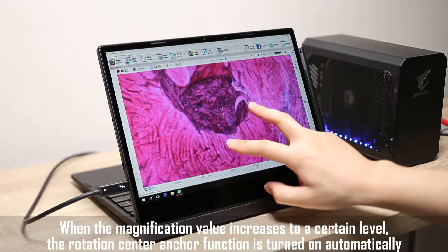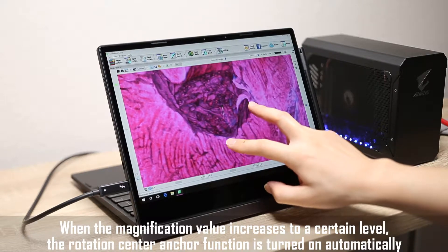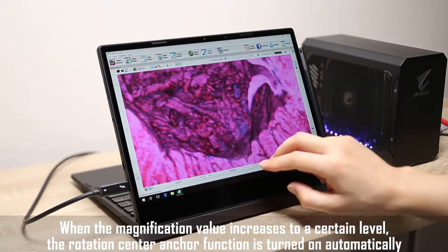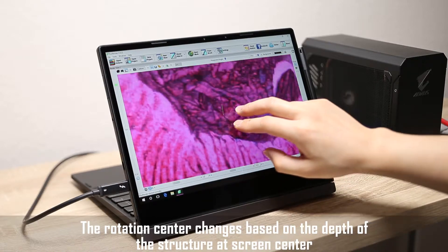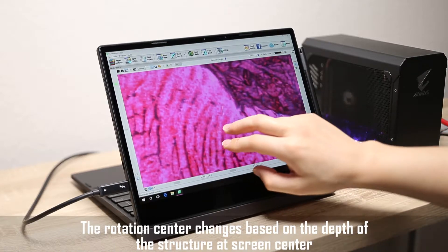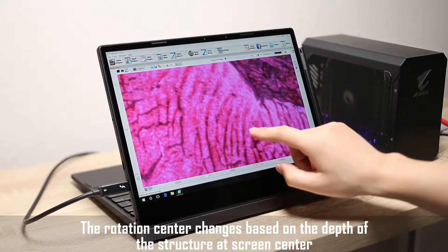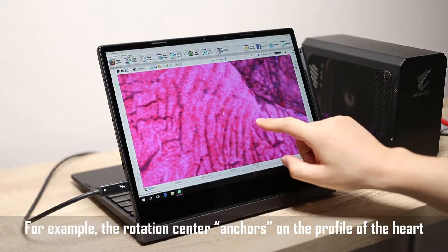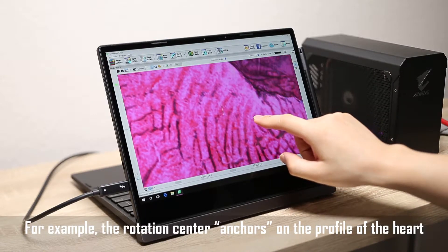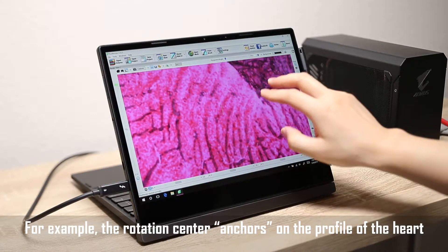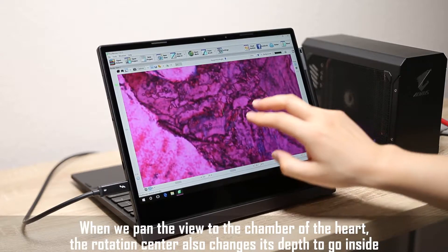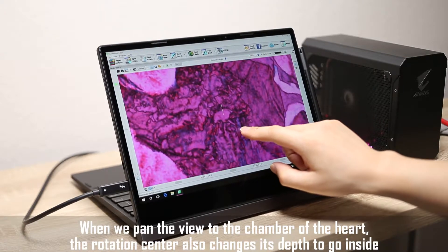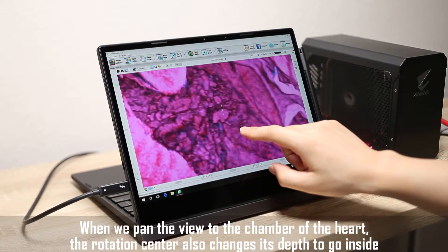We then zoom into the details of this data set. When the magnification value increases to a certain level, the rotation center anchor function is turned on automatically. The rotation center changes based on the depth of the structure at screen center. For example, the rotation center anchors on the profile of the heart. When we pan the view to the chamber of the heart, the rotation center also changes its depth to go inside.